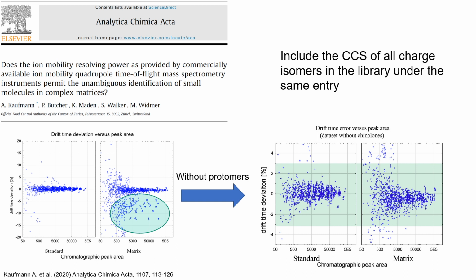But it is true that Kaufmann and co. pointed this out in their paper. If we had a higher ion mobility resolving power, let's say over 100, we would be able to increase the identification capability even further by avoiding missed detects, those false negatives, as well as reaching a better separation of charge isomers, and this is the case for both traveling wave and drift tube.